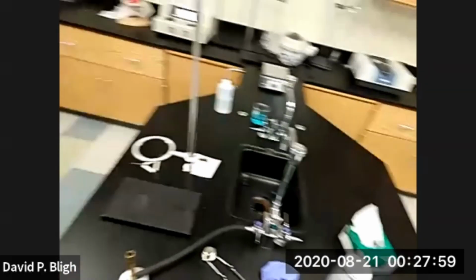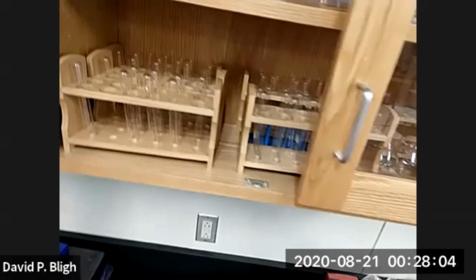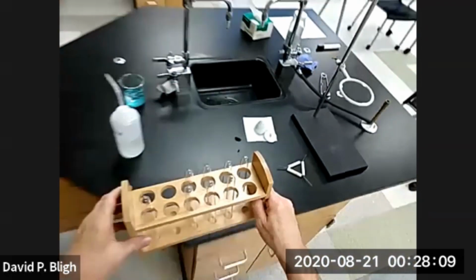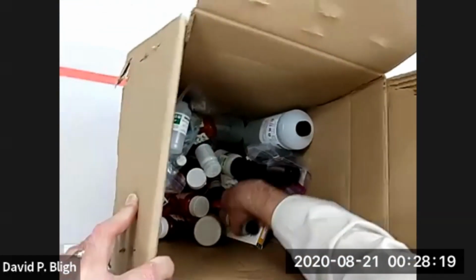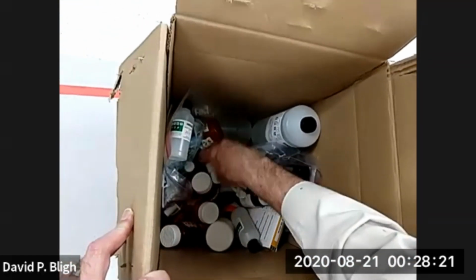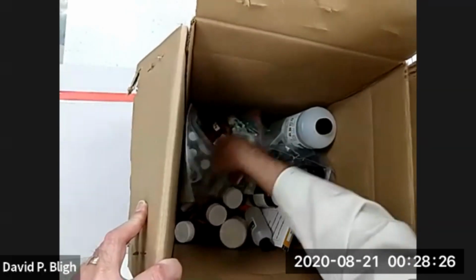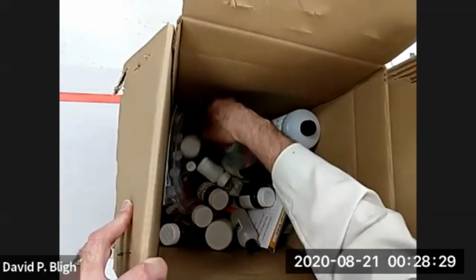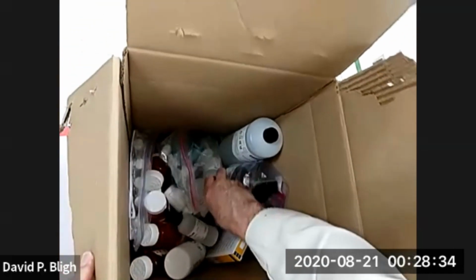right? I didn't put everything out here I need, sorry. Need this to run our Fizz test. So what we need is hydrochloric acid. Let's see if I've got some in here. Nope, that's not it. That's not it. That's not it. Forgot to put it out. I have to go find some.